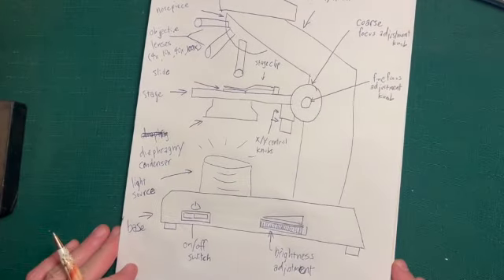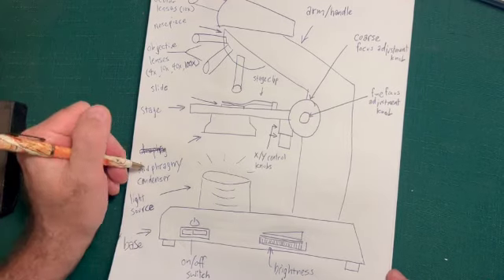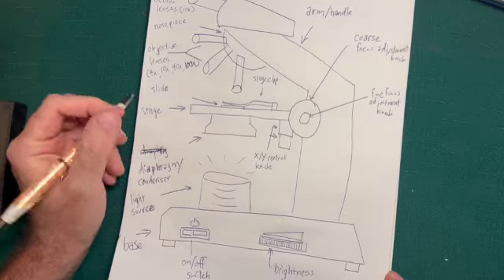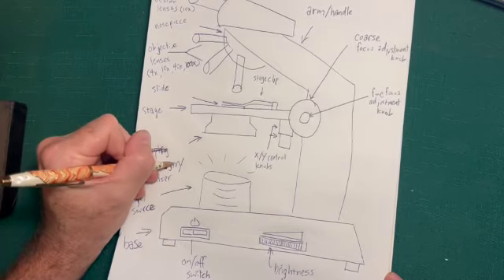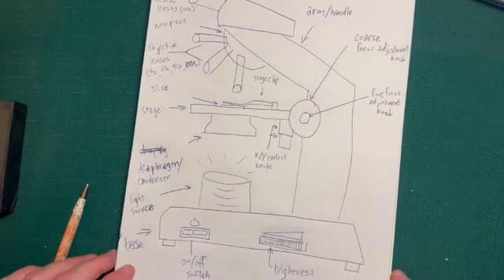Okay, so that's pretty much all the parts of the microscope that you're going to need to know when I show you a picture of a microscope on the exam, or more importantly, when you're in the lab and you're like, how do I get to see things through this microscope? Which you probably used before, but hopefully now this gives you a better sense of what the names of all the parts are.